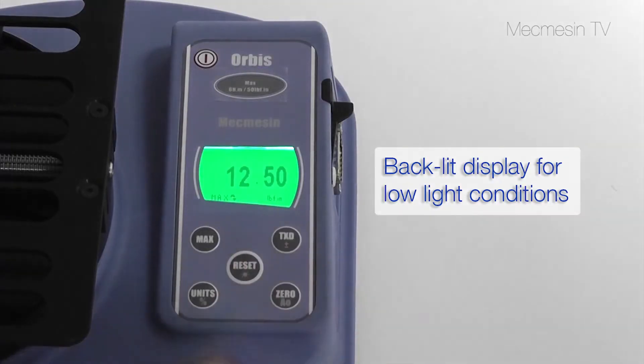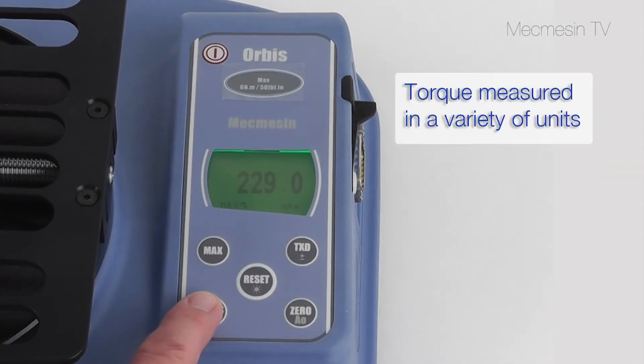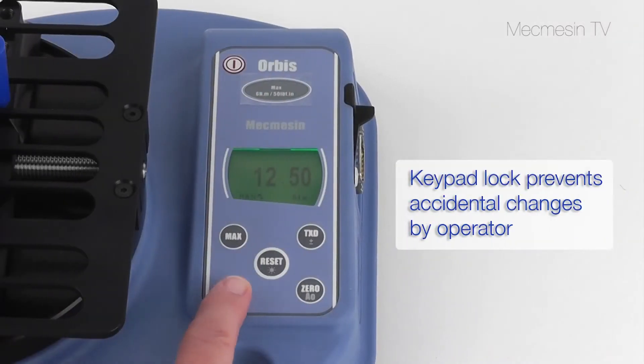The backlit display can be set to show torque measured in a variety of units, including Nm, lb-ft, oz-in, and others. You can prevent unauthorized changing of the displayed units and the max displays by locking out the keyboard.